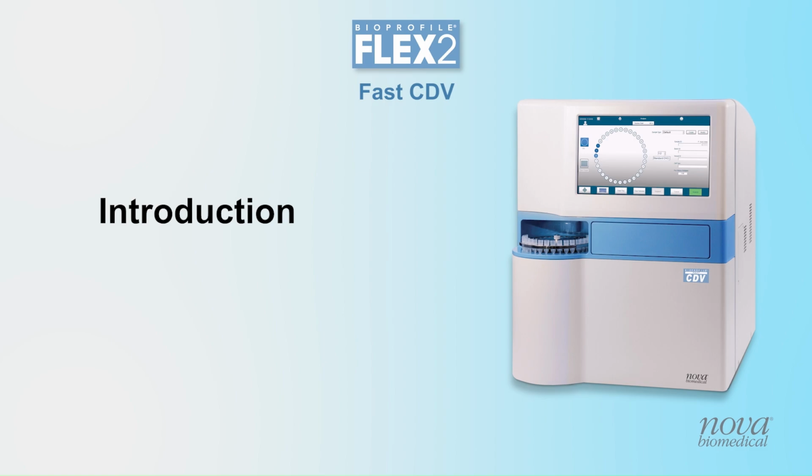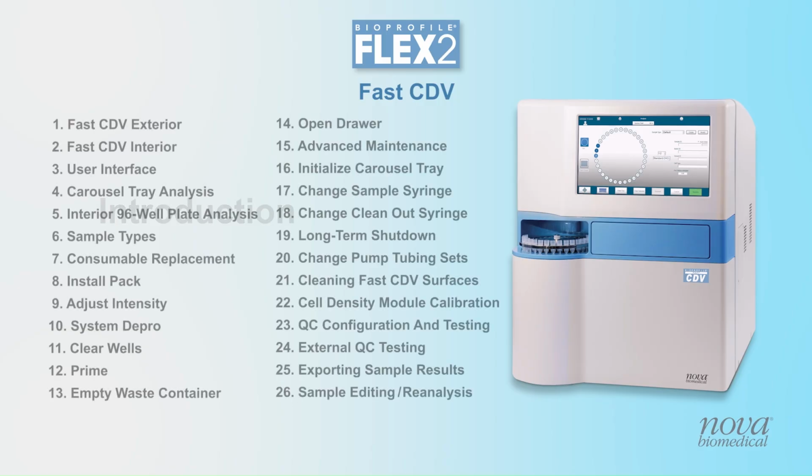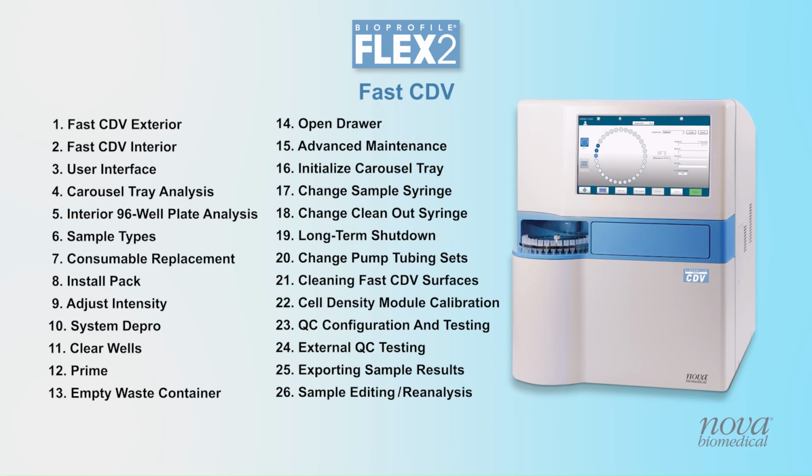Welcome to the online training module for the Bioprofile FAST CDV. This training is designed to cover the components, features, use, and maintenance of the FAST CDV. These modules are broken down into multiple parts to make it easier to navigate. So feel free to skip to the module you are looking for, or start from the beginning. I think you'll find these modules easy and intuitive. So let's get started.